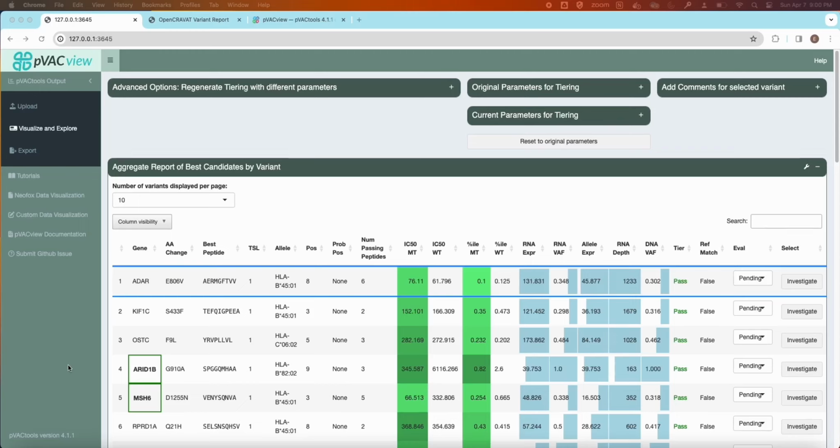Welcome to part 4 of the pVACview demonstration. In this video, we will use pVACview to further explore our data.